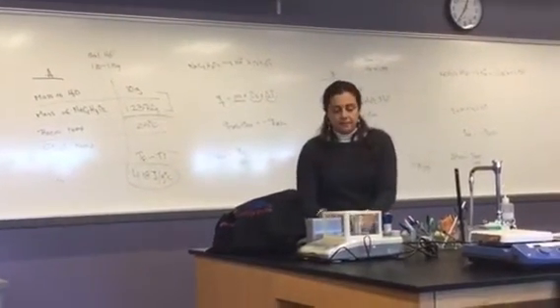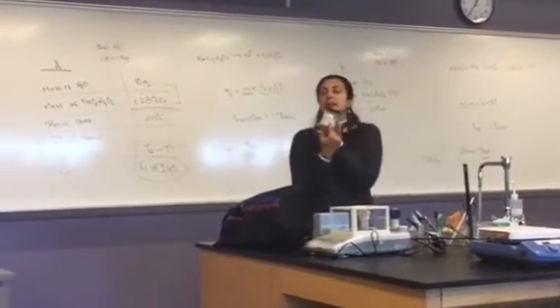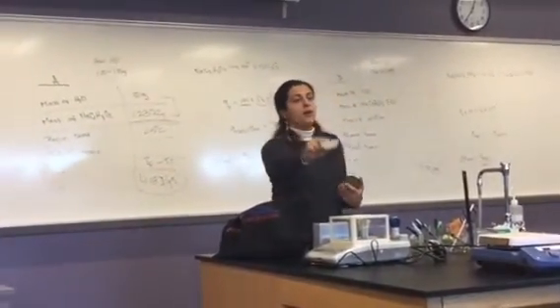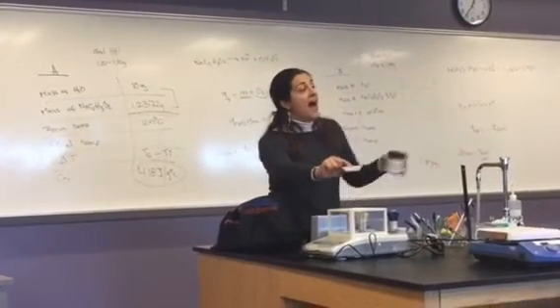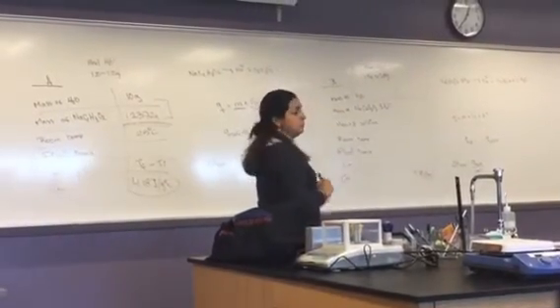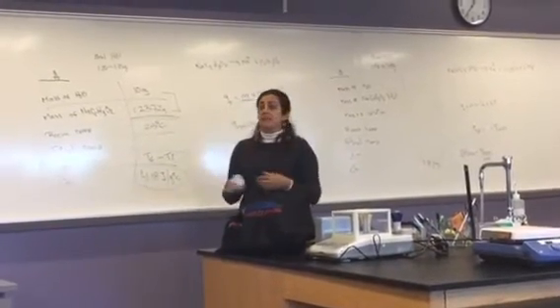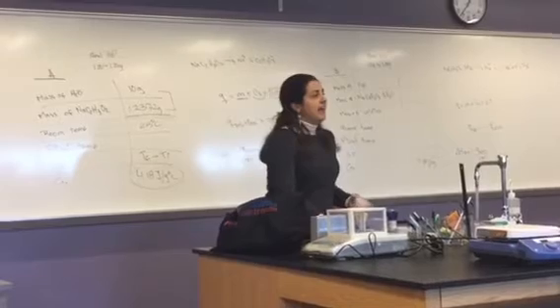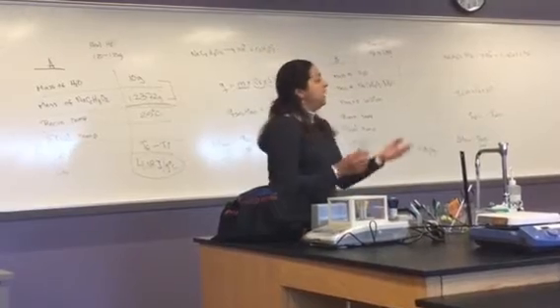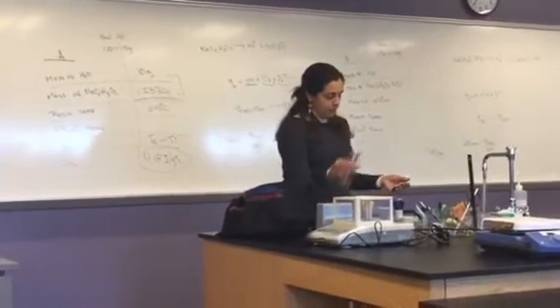The second part of the lab, we're going to use sodium acetate trihydrate. Make sure that you read the labels. For this, we repeat the process. We take a weighing boat, put it on our balance, make sure that it reads 0, and add the salt until you record between 1.96 and 2.04. Again, record every single number that comes out of your balance, even if it's 0. Take a clean test tube, pass the salt to it, add 10 milliliters of water, check the temperature at the beginning, check the temperature at the end, and once you're done, you can dispose of this in the sink.